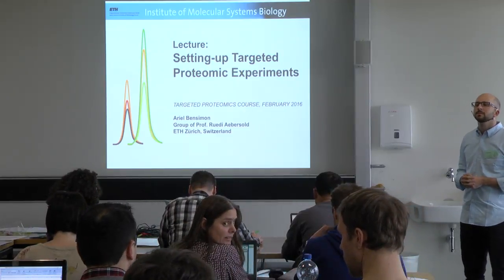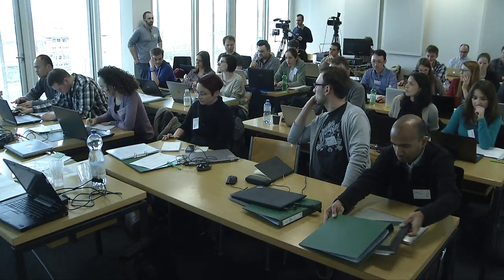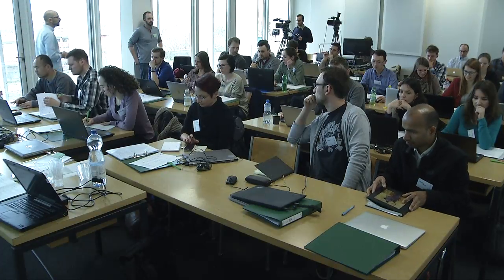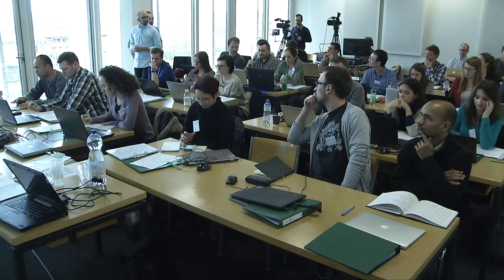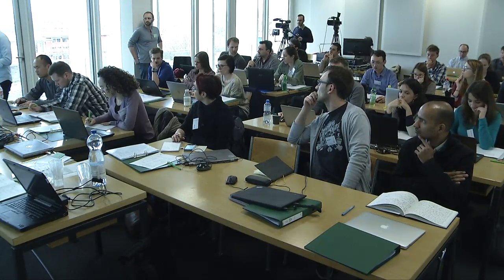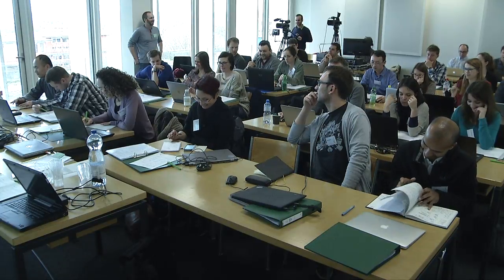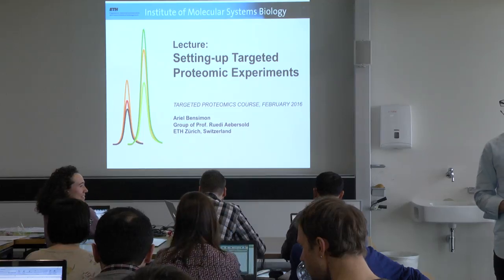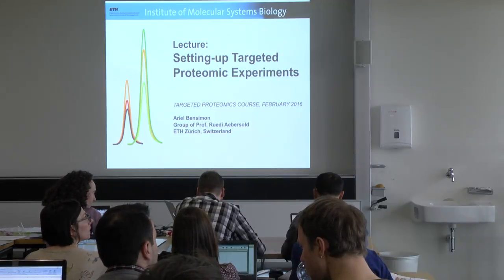One is the precursor ion. Mm-hmm. And one is the sequence of the peptide, the collision energy, and 0 is, I think, this declustering. Exactly. And so, there's another column which you didn't explain? The fragment ion. And another one which you didn't say anything about? There's a number there that's equal to all of them. The number would be 20. The cycle time. Oh, dwell time?